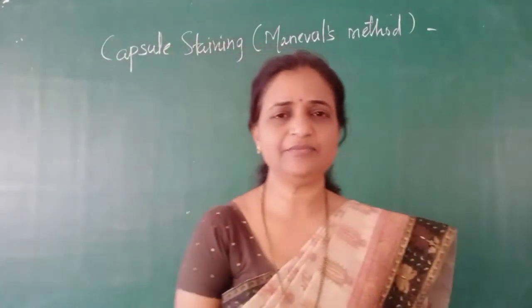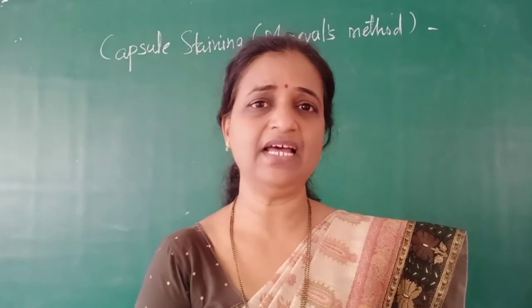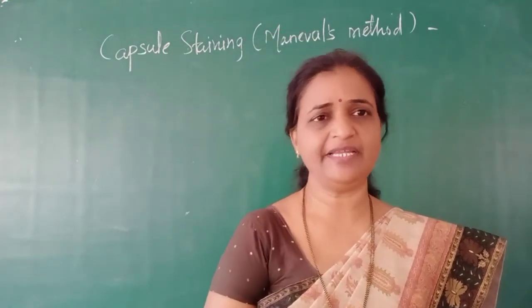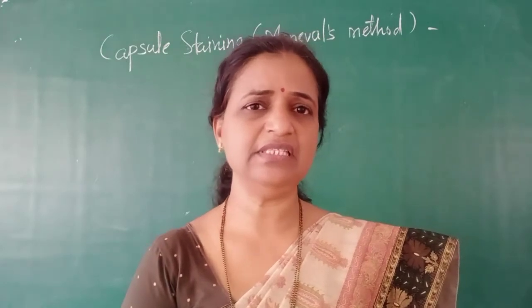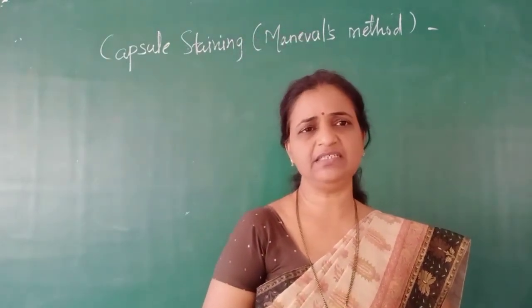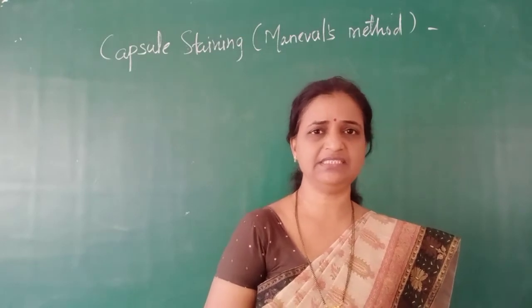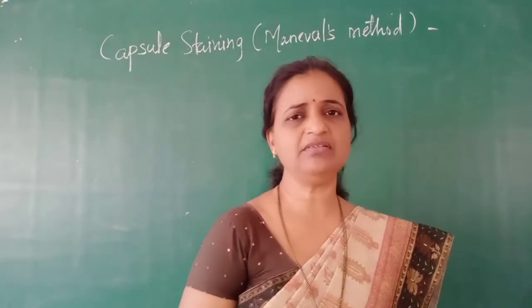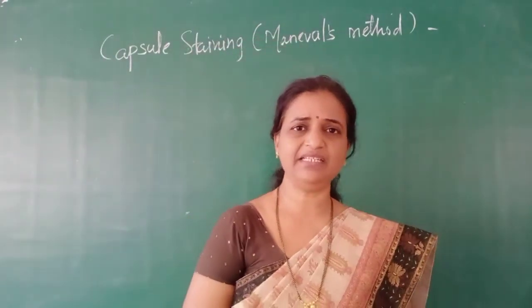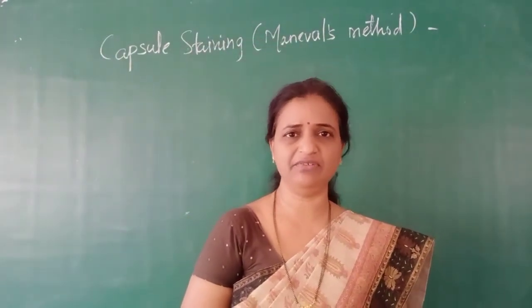Hello friends, hope you have seen our last lectures on the different types of staining procedures. In the last lecture we studied the first example of special staining, that is cell wall staining by Chance's method. Now in this lecture we are going to observe the demonstration of bacterial capsules by using Maneval's method.